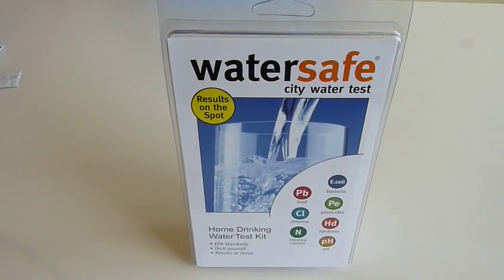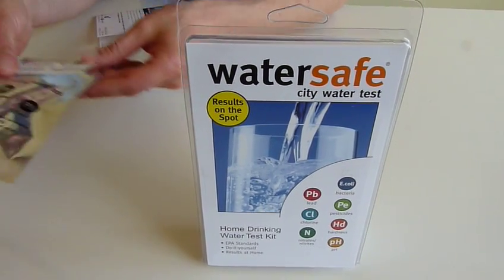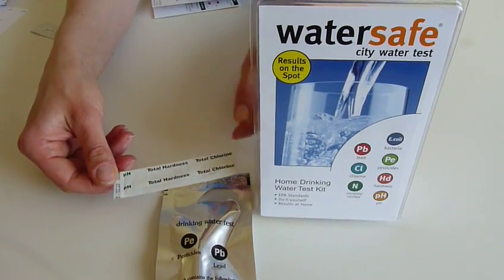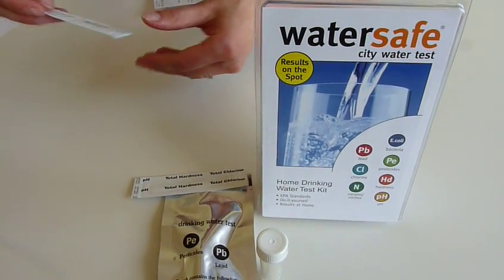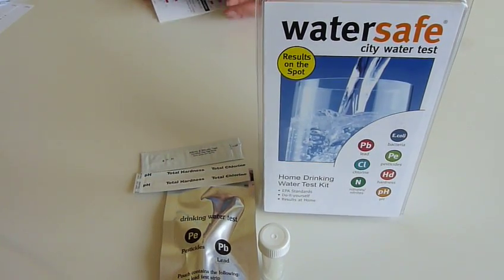Now, this test kit contains a number of test kits. Included is a pesticide test and a lead test, a total hardness and total chlorine test, a vial so you can test bacteria in your drinking water, and a test to test nitrates and nitrites together.